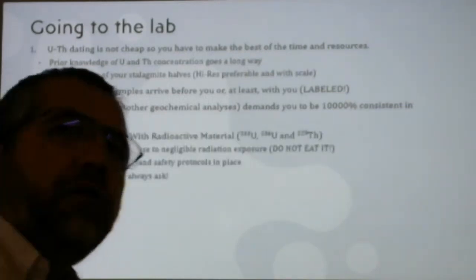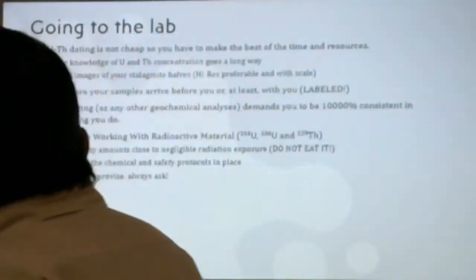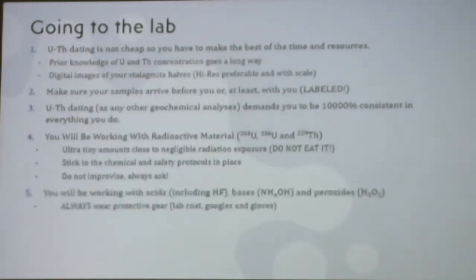Yes, you will be working with radioactive material, and that basically means that you'll be exposed to radiation, but it's extremely tiny. You'll get more radiation by eating a banana, and I'm serious, than by working in a uranium series lab. Unless, of course, you decide to eat your samples. Nevertheless, the lab manager or someone in the lab will have worked on developing the safety protocols. Stick to them, do not improvise.